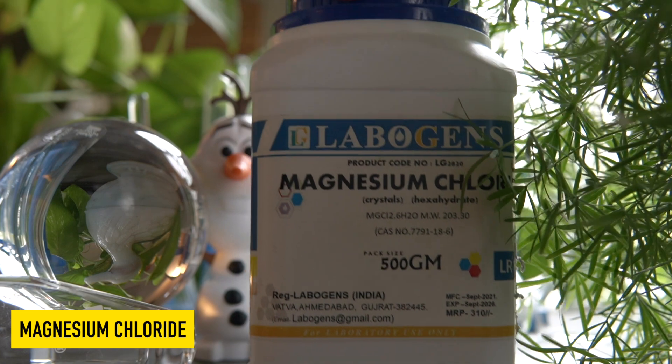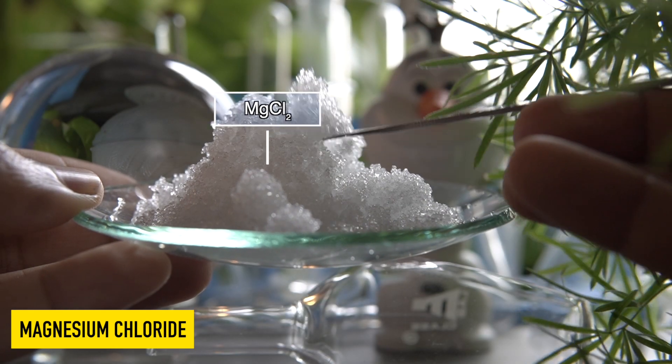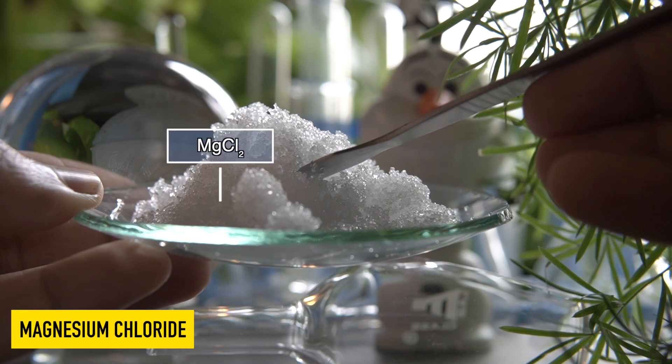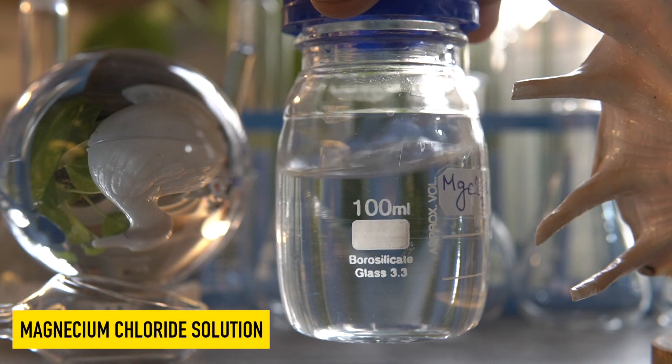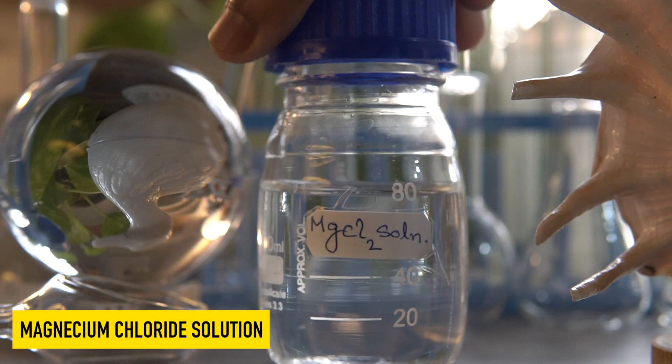This is magnesium chloride, a deliquescent white solid. It means that it has a tendency to absorb moisture from air and dissolve in it. It's very easily soluble in water to make its solution.